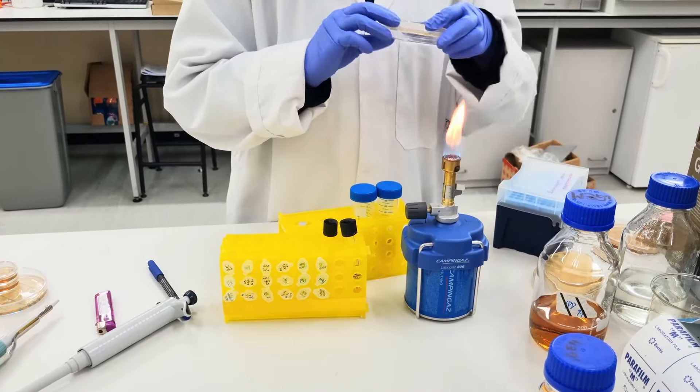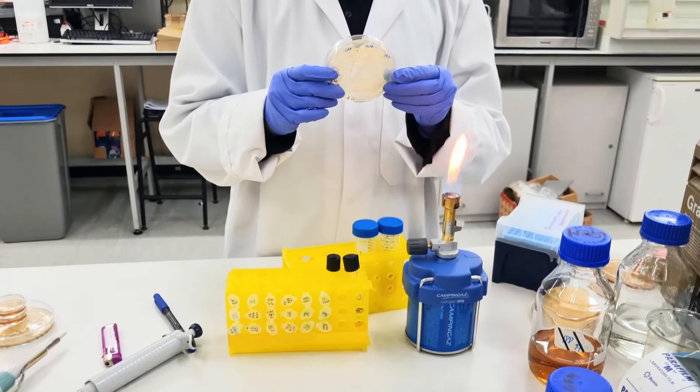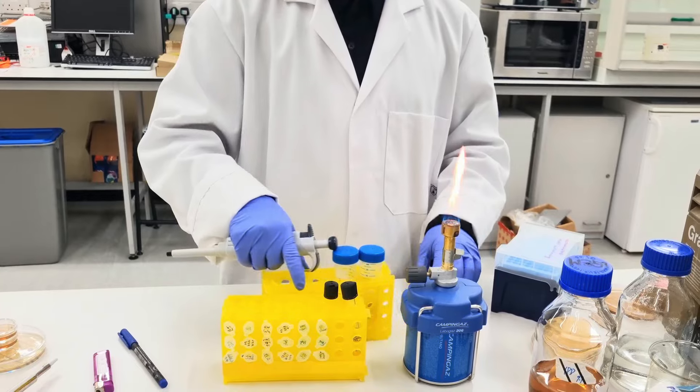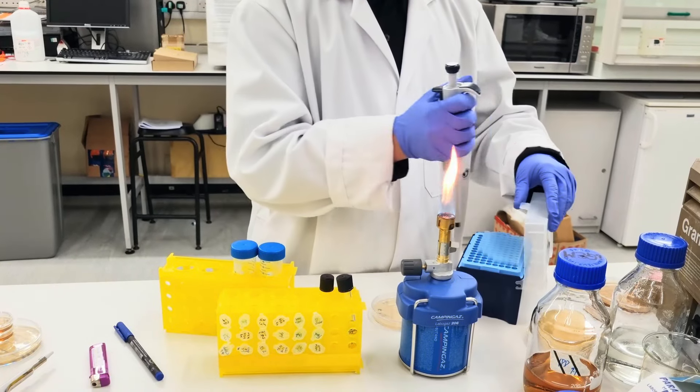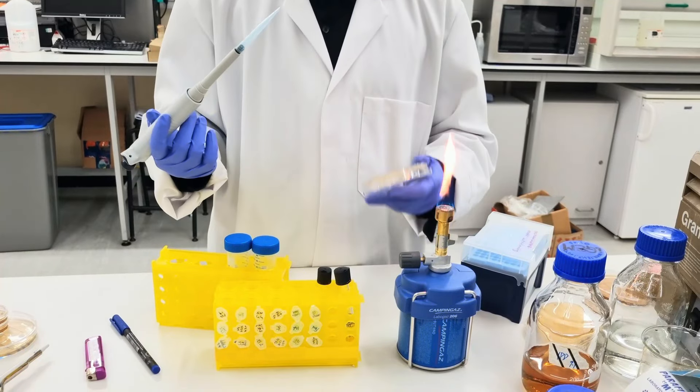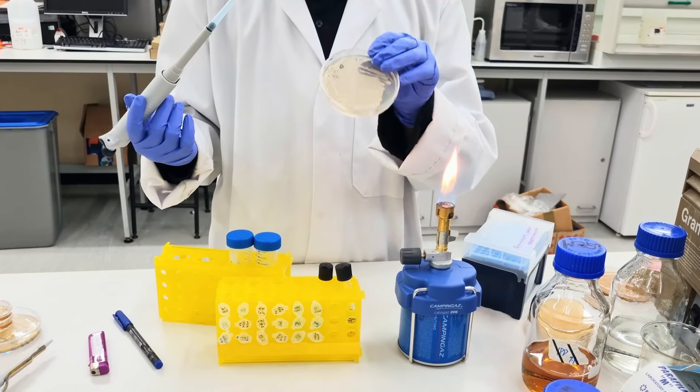And the next step is to get a fresh plate with the colonies you want to inoculate. Use one pipette tip to take one of the single colonies on plate.